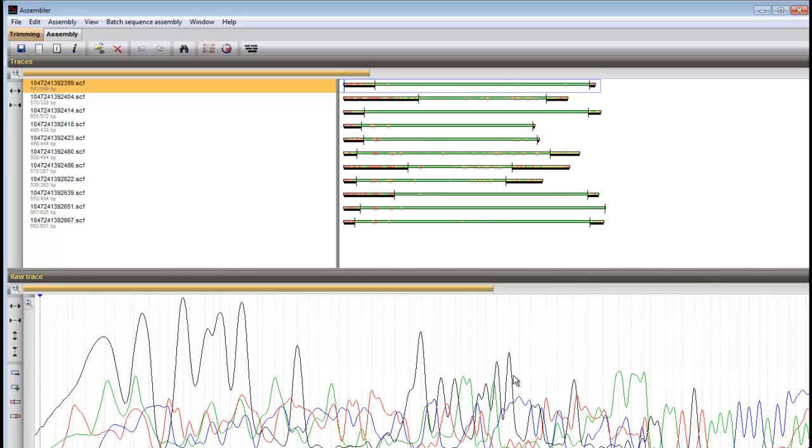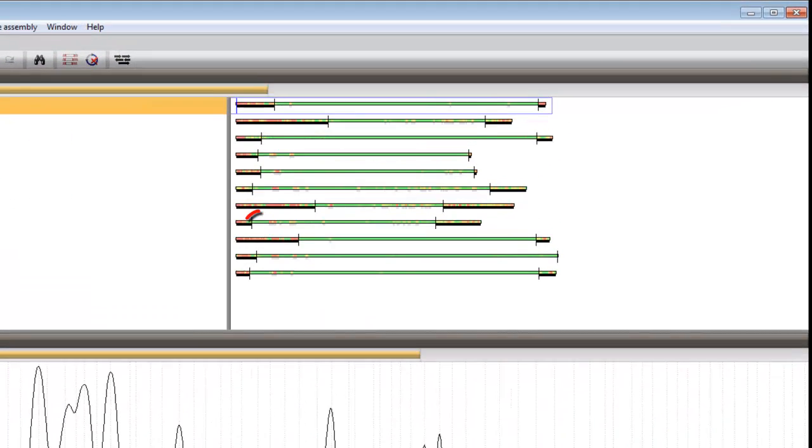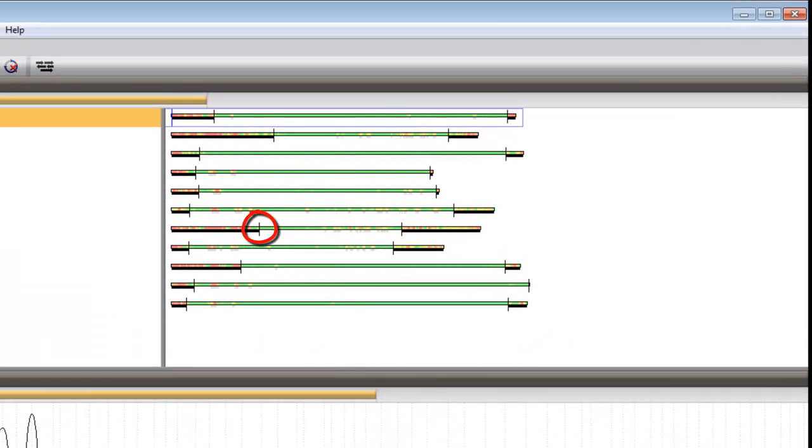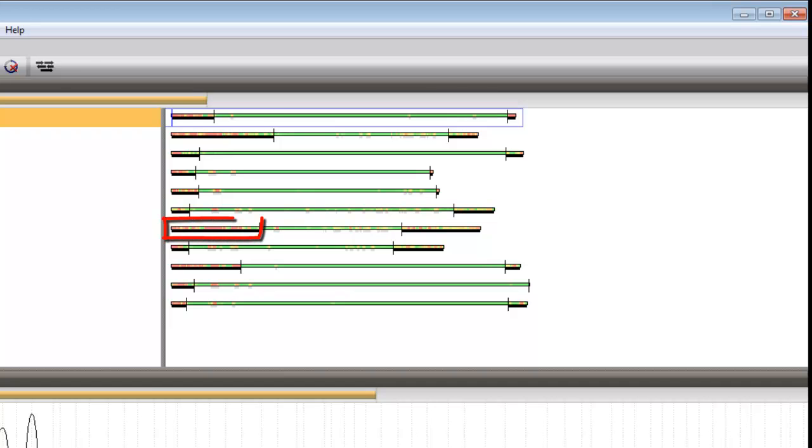The beginning and end of each partial sequence, which usually are of lesser quality, were automatically trimmed off. The trimming sides are marked by black pipes, and the trimmed off regions are underlined by a black bar.